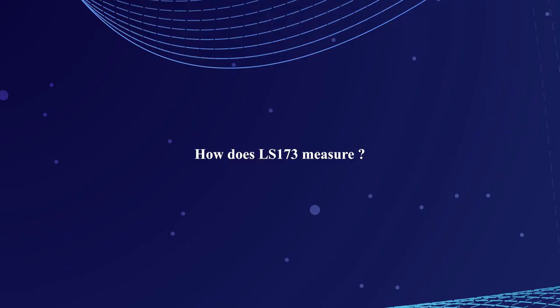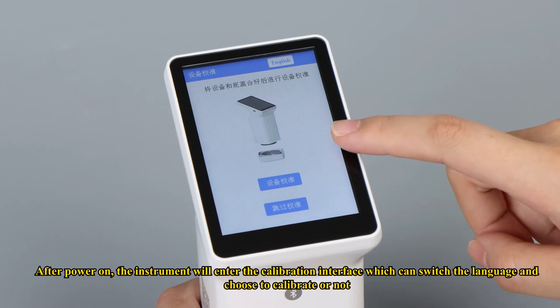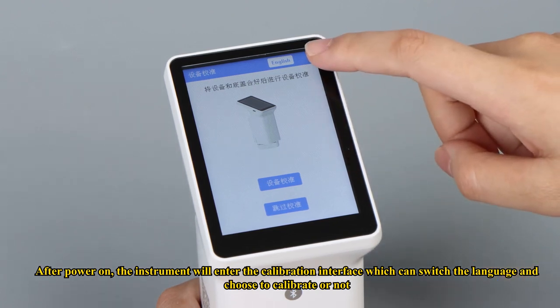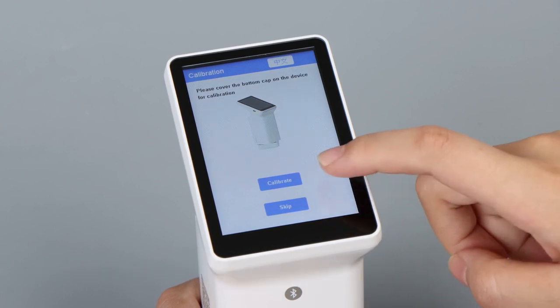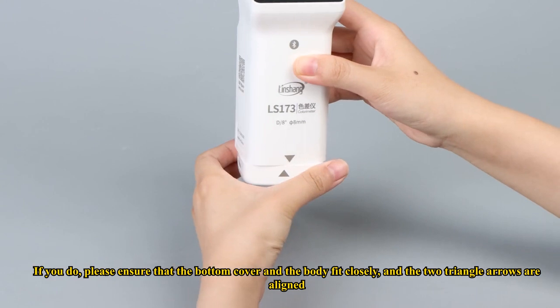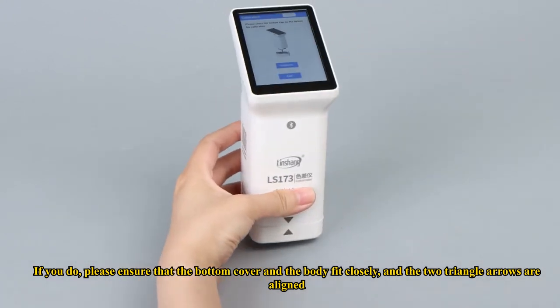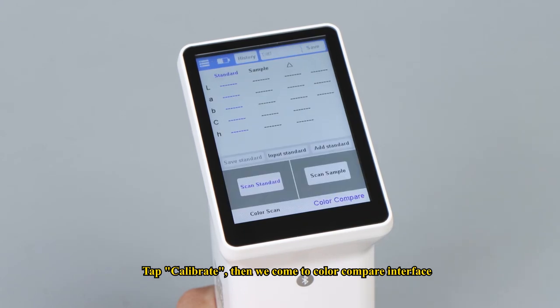How does LS-173 measure? After power on, the instrument will enter the calibration interface, which can switch the language and choose to calibrate or not. If you do, please ensure that the bottom cover and the body fit closely, and the two triangle arrows are aligned. Tap calibrate, then we come to the color compare interface.